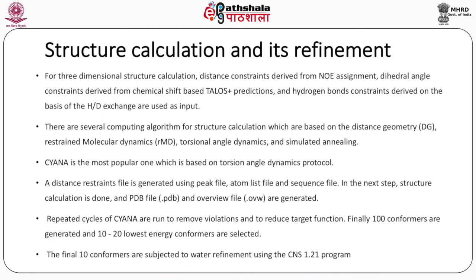There are several computing algorithms for structural calculation which are based on the distance geometry, restrained molecular dynamics, torsion angle dynamics, and simulated annealing. Cyana is the most popular one, which is based on torsion angle dynamics protocol.